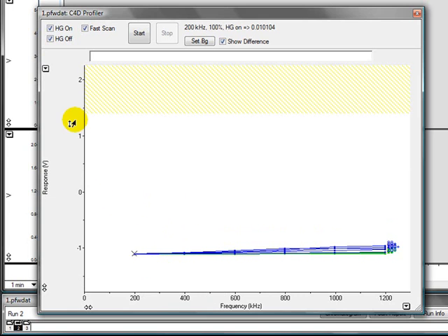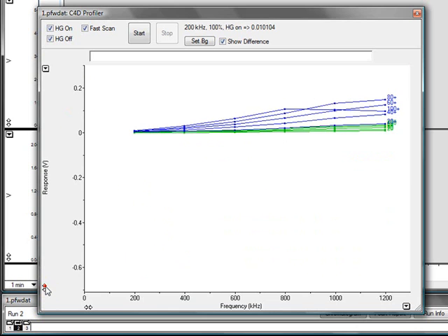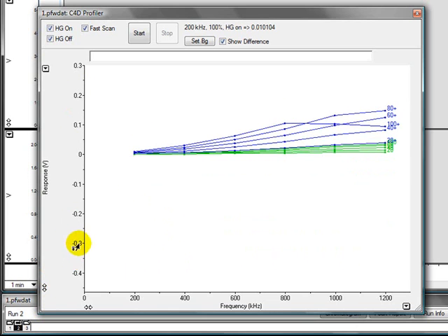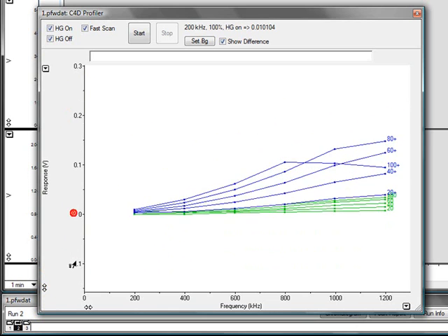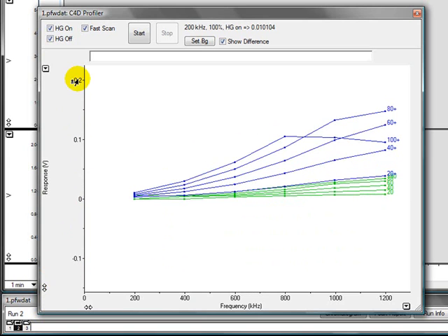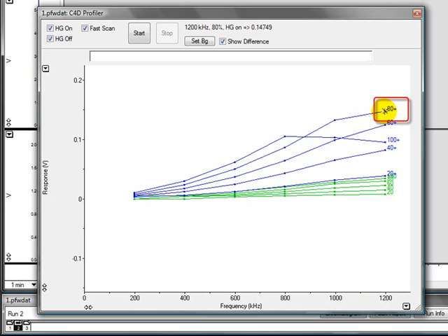You will have to expand the plot here. The best C4D settings are the ones which give you the biggest change in response, the difference between the background electrolyte and the diluted background electrolyte. In this plot, you can see it is this point here. This was conducted at 1200 kHz at 80% with the head stage gain on.